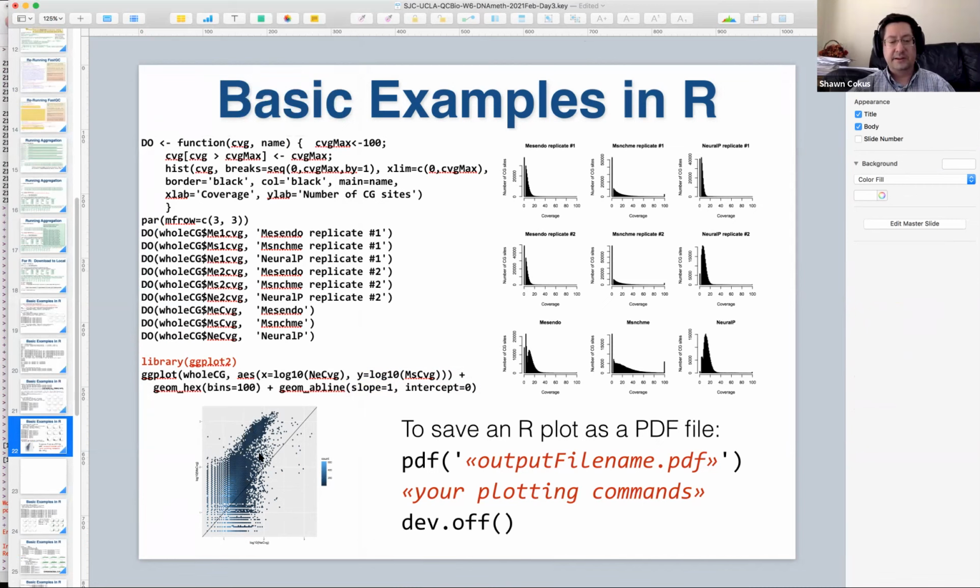Although there's not really many dots out here. So if you're concerned with the regions out here, a straight up scatter plot may actually be better. And you can see in this sample, certainly at these sites... No, I did the pooled ones. So this is the pooled neuronals versus the mesenchymals.